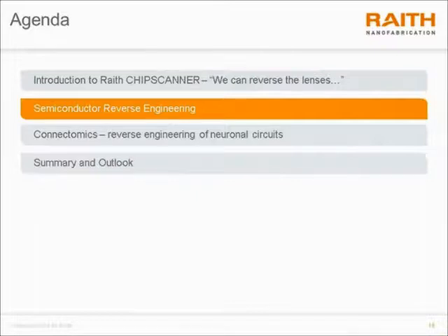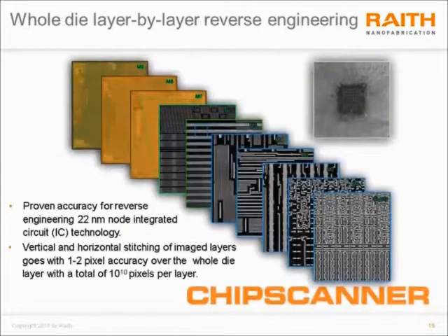So, the chip scanner has a few applications that I wish to share with you now. The first being semiconductor reverse engineering. In reverse engineering, an unknown chip is deprocessed layer by layer, and each layer is imaged.